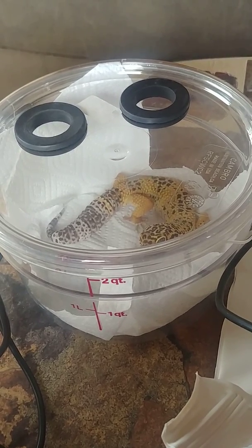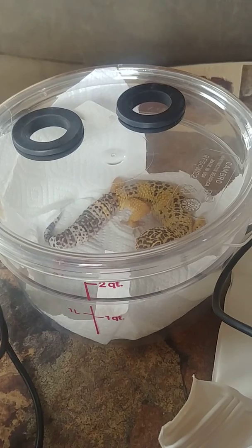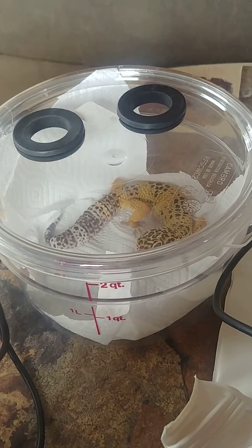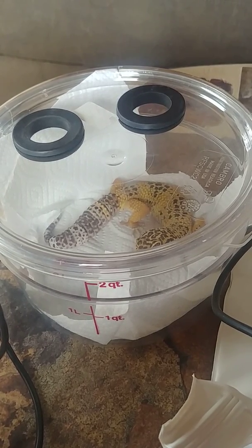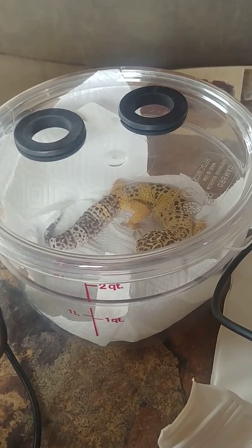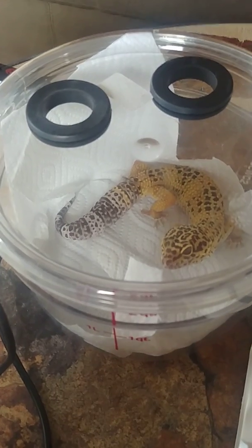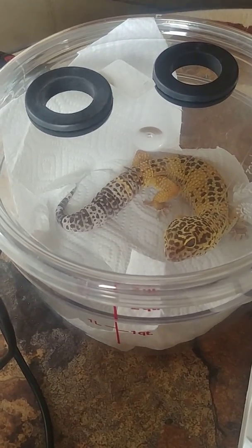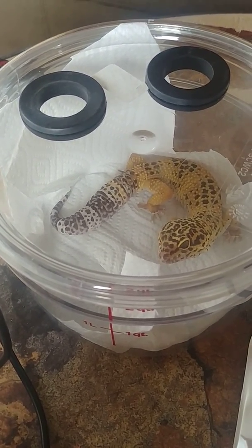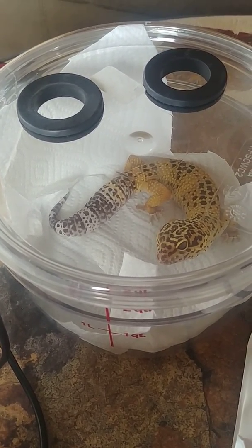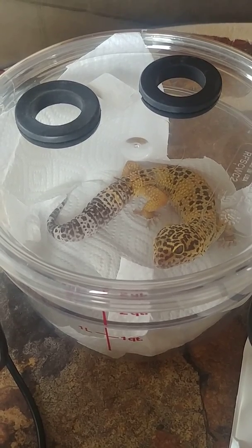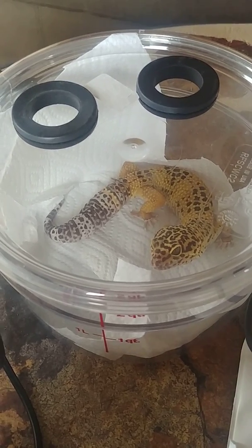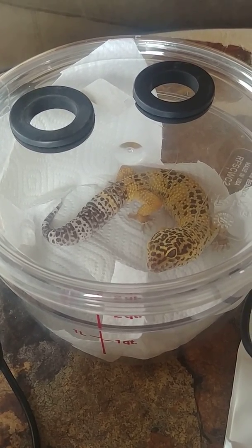And for around 30 degrees Celsius, five to 10 is those animals that were on ice. The 22 is about room temperature in our labs on campus. And then the 30 degrees is with the heating pad. And then you can look at how the metabolic rate of these different animals changes depending on the temperature of their environment.